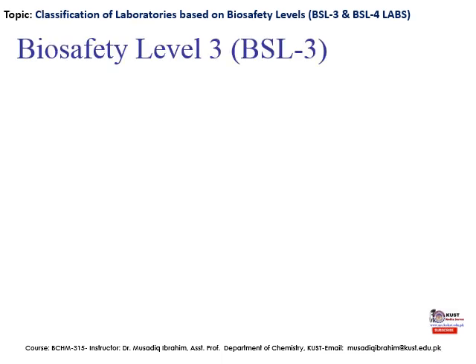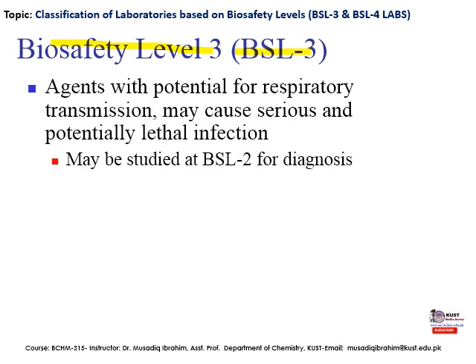Now, moving towards the biosafety level 3 or BSL-3 labs. A BSL-3 laboratory must be used when work is done with indigenous or exotic agents that have the potential for respiratory transmission and may cause serious and potentially lethal infection. Now, the materials which are potentially infected with these agents may be studied at BSL-2 level for diagnostic purposes only, but further manipulation and experimentation then requires BSL-3 conditions.